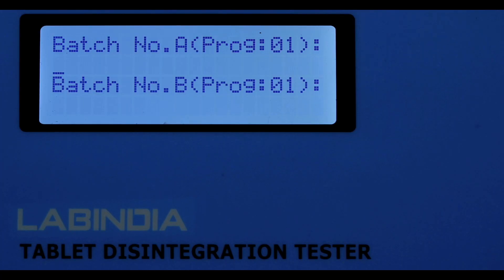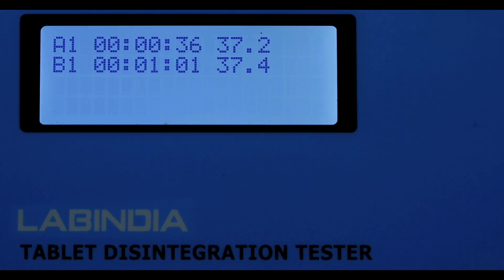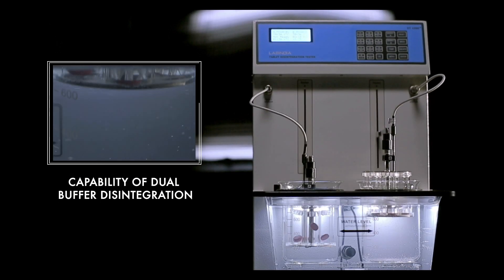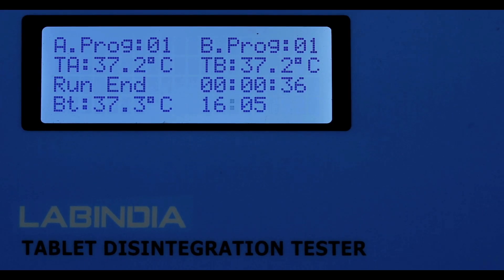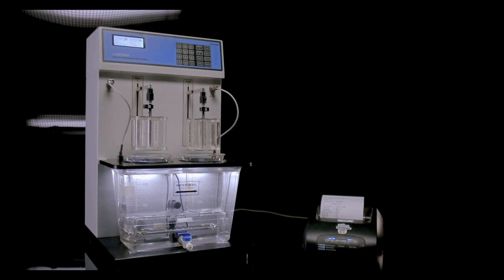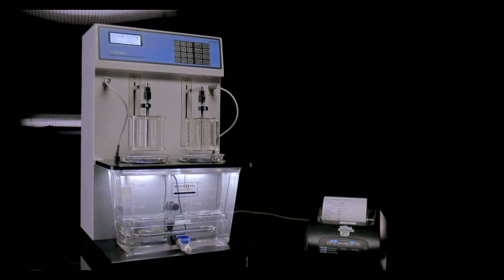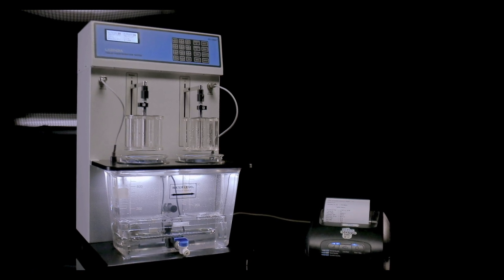The individual run profile for each basket can even store individual time and temperature for each tablet. The feature of station out facility after the end of the run, the software is user-friendly in dialogue mode.